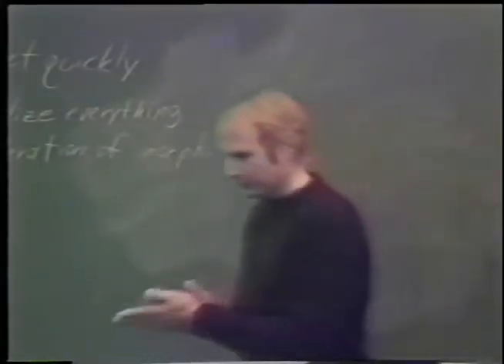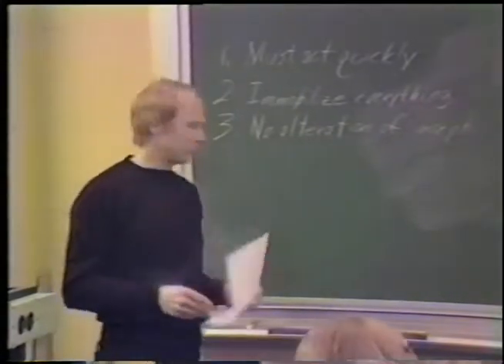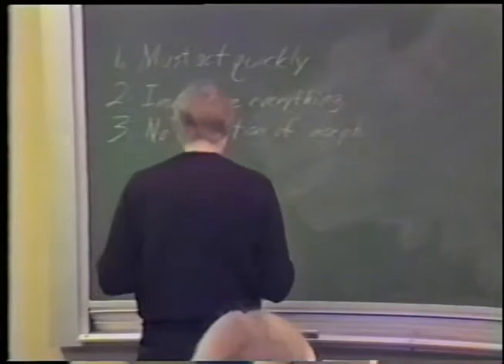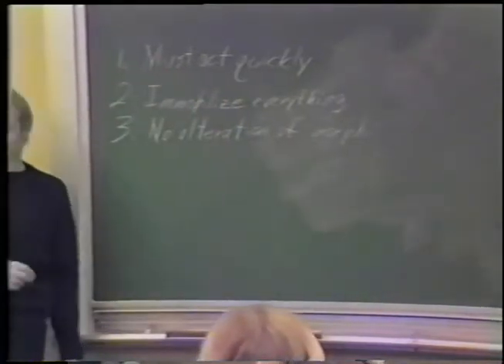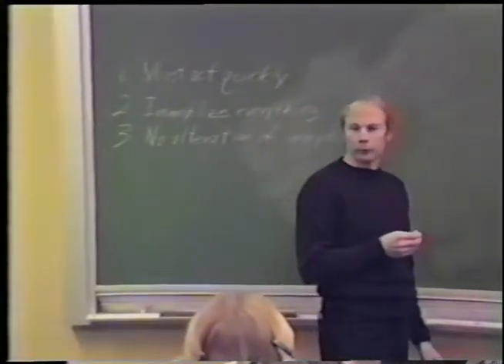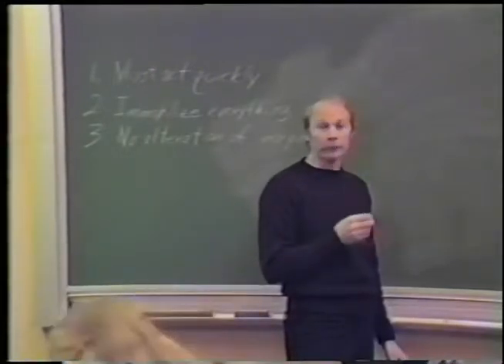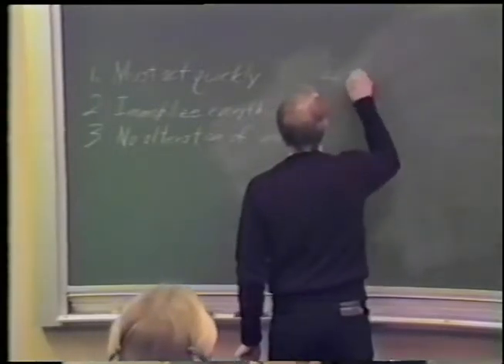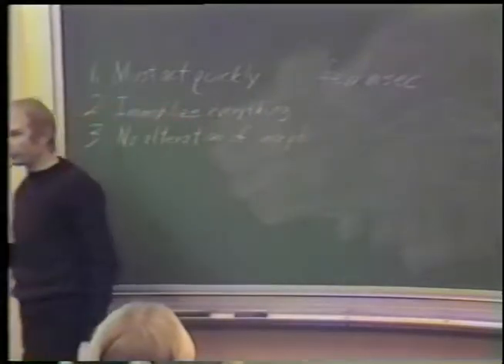Let's see how ultra-rapid freezing stacks up against chemical fixation and cryoprotection. Okay, we specified that a fixative has to act quickly. Well, at the rates required to achieve ultra-rapid freezing, it's clear that in the samples in which you can be successful, everything is frozen in a few milliseconds. And that's as fast as we can hope for at the present.